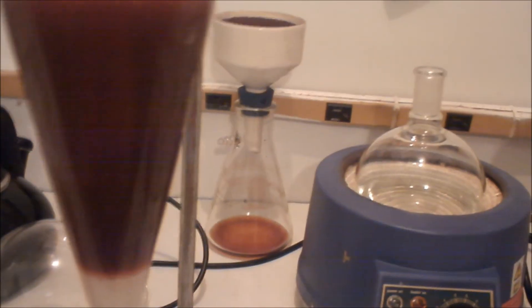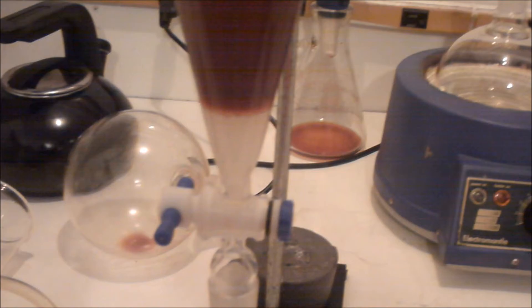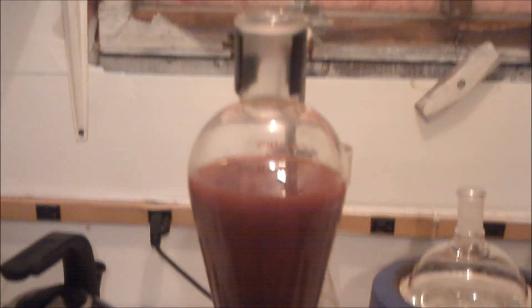All you're going to want to do is just take this and don't shake it — just tilt it back and forth gently. I'm going to do three 15 milliliter washes with the dichloromethane, and then we'll get back to you when I'm done with that.